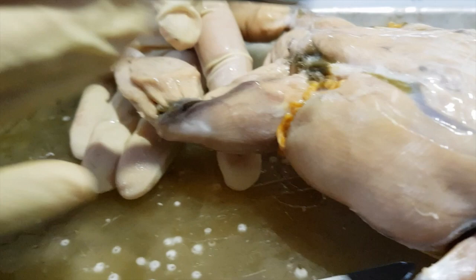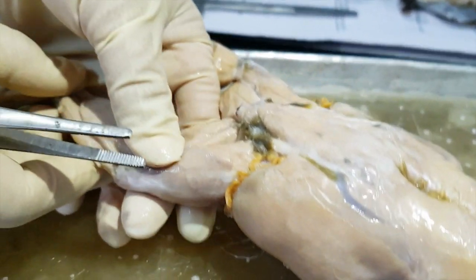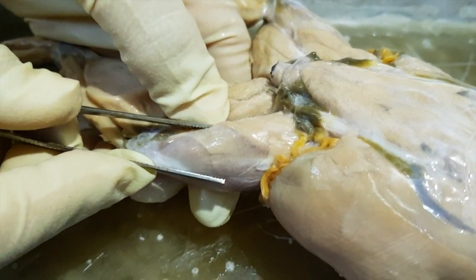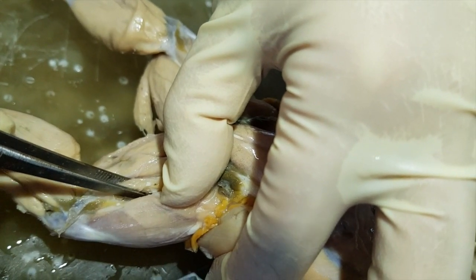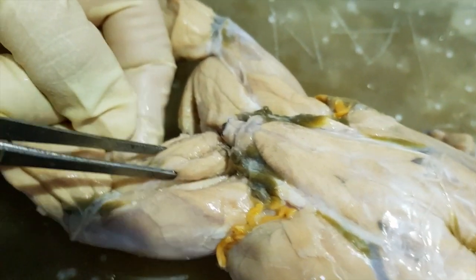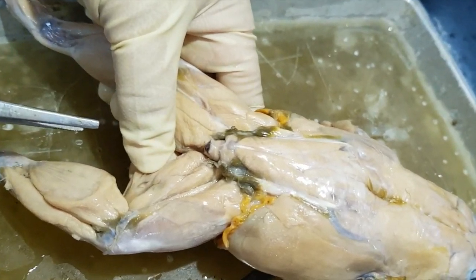Okay, so dorsal side muscles of the limbs. The big one here is for the thigh. This one big muscle, which supposedly has three origins, is the triceps femoris. Then if you just deflect that and put it on the side, you will see a small muscle in here. That's the biceps femoris. Okay. This muscle here towards the inner thigh is the semimembranosus. This one. And this flap of muscle is the gracilis minor, which can also be seen on the ventral side.